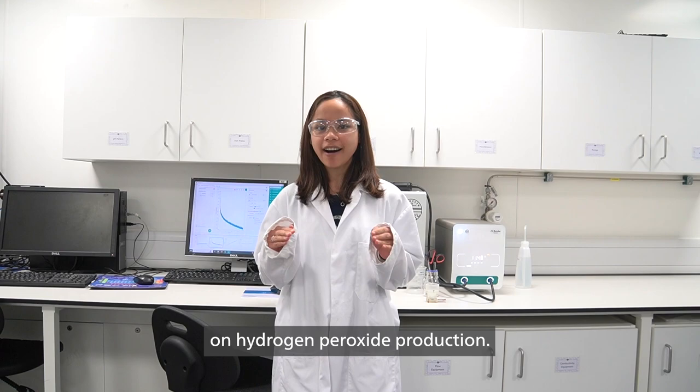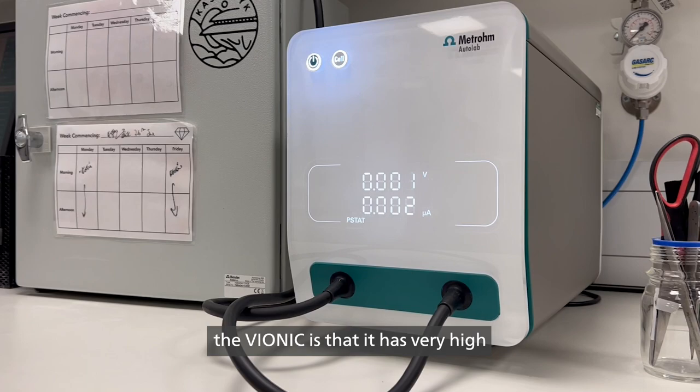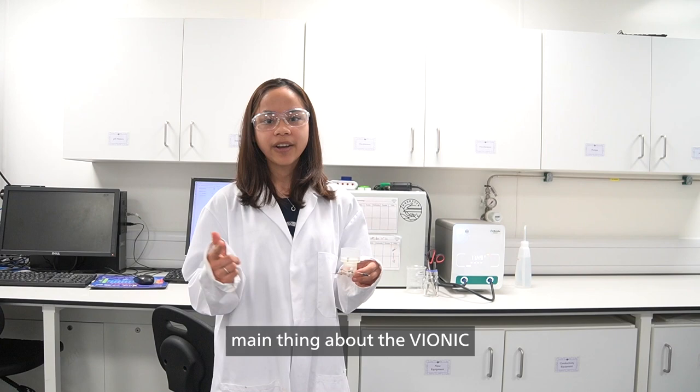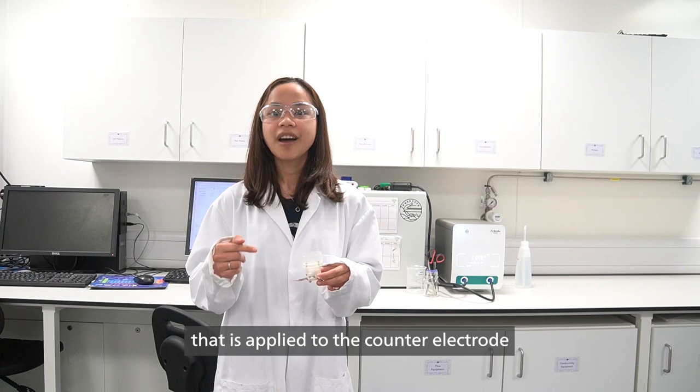My project is mainly focusing on hydrogen peroxide production. So one main reason that I really like the Autolab is that it has very high compliance, so we can also apply very high potential to the counter electrode. Another main thing about the Autolab is that you can track the potential applied to the counter electrode, which is amazing.